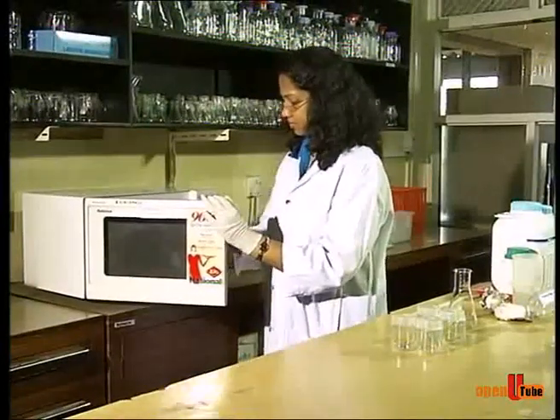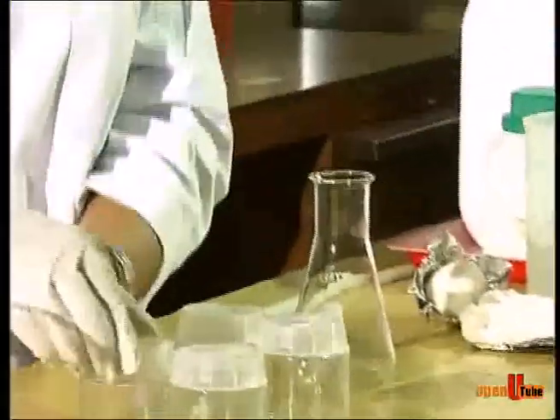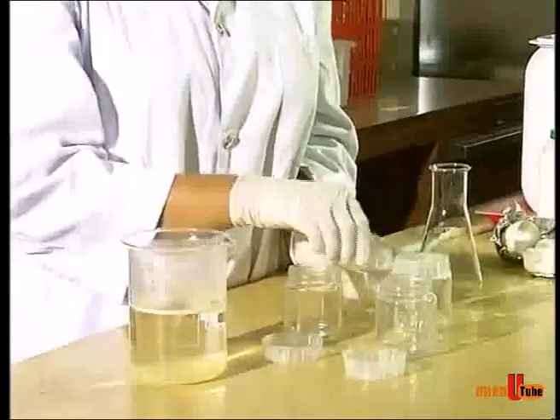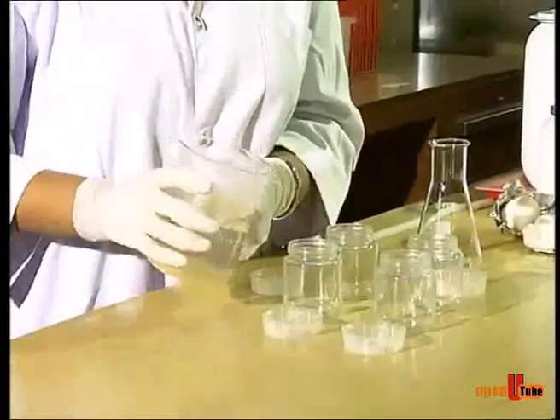When agar is completely dissolved, the MS solution should look very clear. Then transfer the MS medium into small containers which are used to grow the explants.